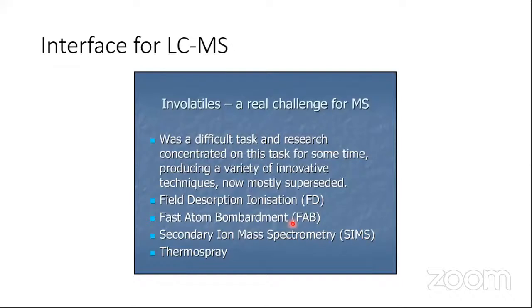So I put a cartoon. I like to draw a cartoon. LC works in the liquid phase, taking samples which are in the liquid phase.